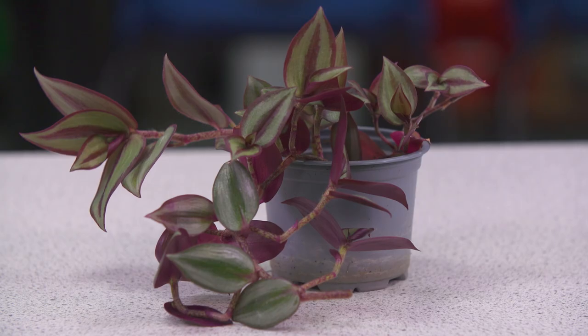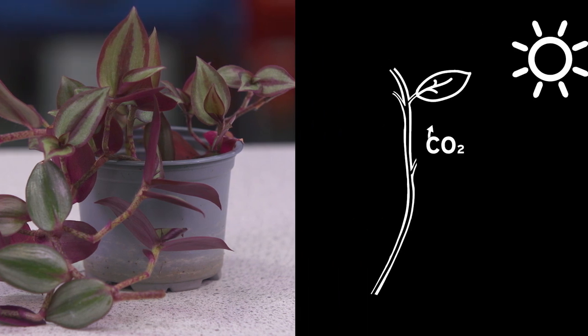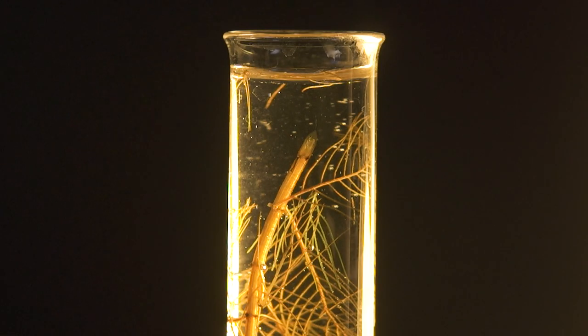So why does pondweed bubble? This is a classic photosynthesis practical, but it is somewhat counterintuitive. Often students learn about photosynthesis in a terrestrial plant where gas exchange happens via stomata into the air. And here we are looking at it in an upturned aquatic plant, which is releasing bubbles of gas from its stem.